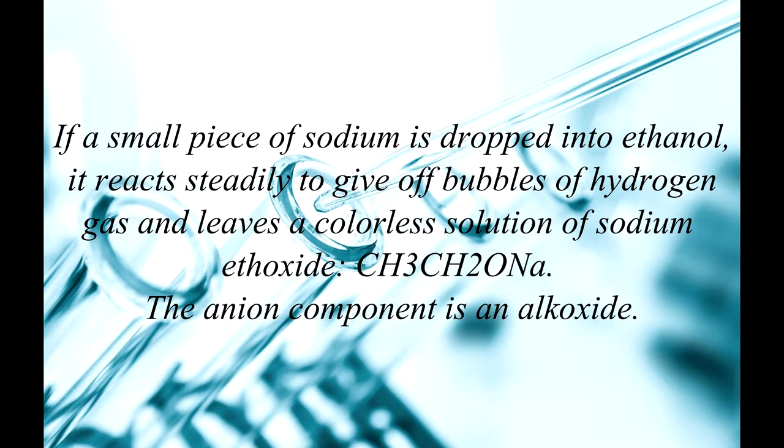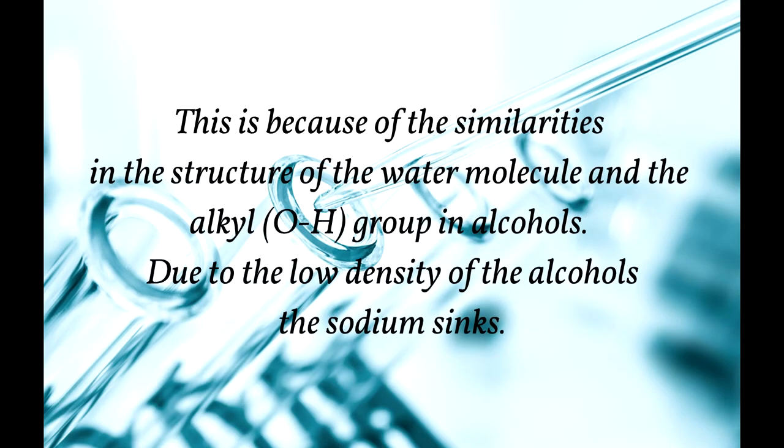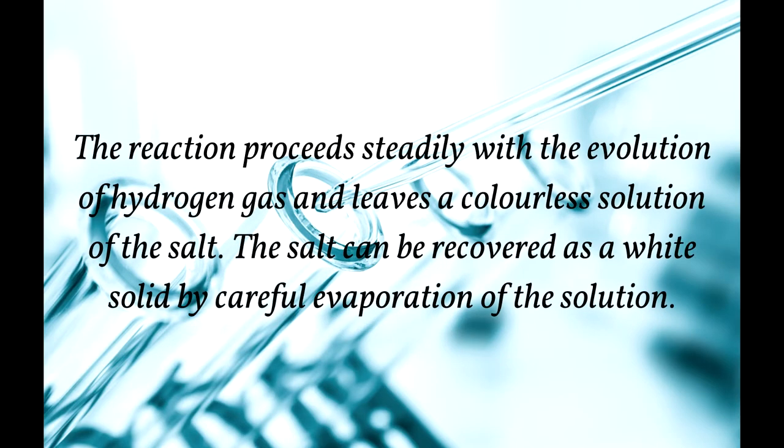If a small piece of sodium is dropped into ethanol, it reacts steadily to give off bubbles of hydrogen gas and leaves a colorless solution of sodium ethoxide, CH3CH2ONa. The anion component is an alkoxide. This is because of the similarities in the structure of the water molecule and the alkyl group in alcohols. Due to the low density of alcohols, the sodium sinks. The reaction proceeds steadily with the evolution of hydrogen gas and leaves a colorless solution of the salt. The salt can be recovered as a white solid by careful evaporation of the solution.